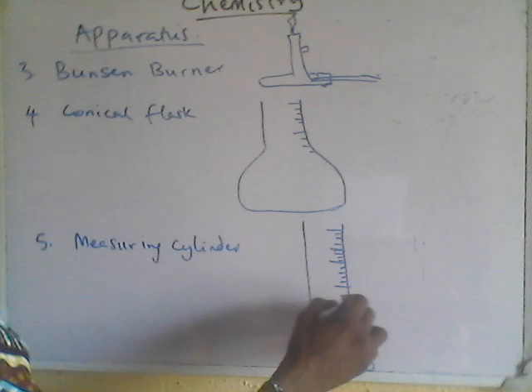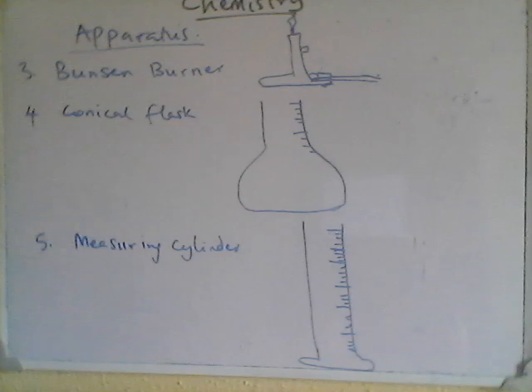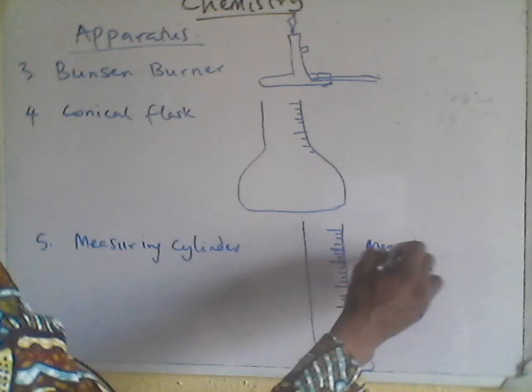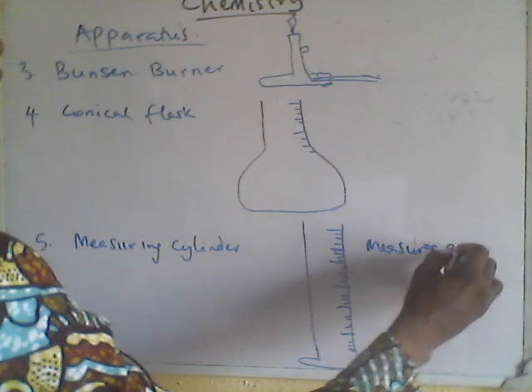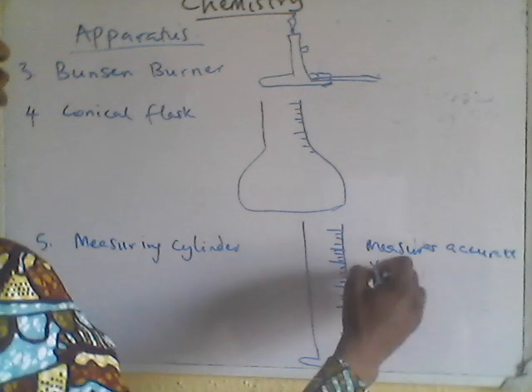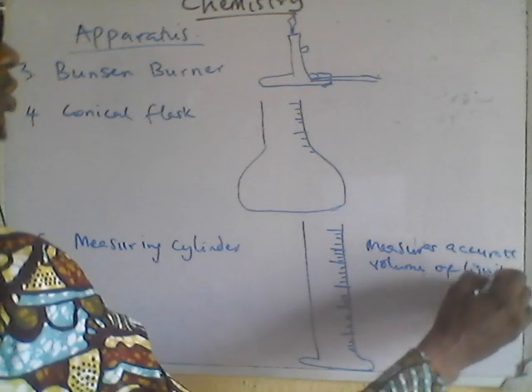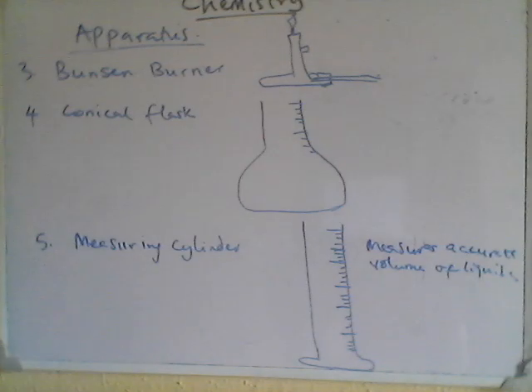Okay, so the measuring cylinder measures accurate volumes of liquid. So that's what it does.